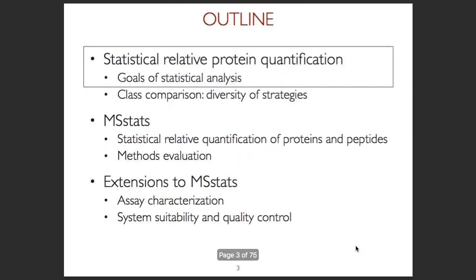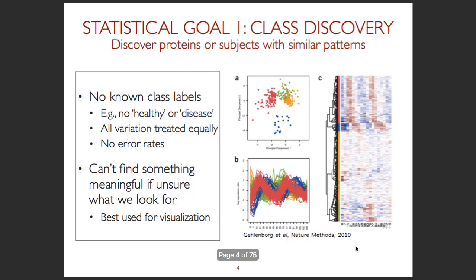So this is one. And two more things that I would like to review from last week as well, because this is really important for us to understand the data and understand the questions we'll be working with. So one is talking about the goals of statistical analysis, and the other is an example of why in mass spectrometry, in particular, these goals sometimes can be difficult to achieve. So let me very briefly review the goals of statistical analysis, and this is important for us for these 2.5 days.